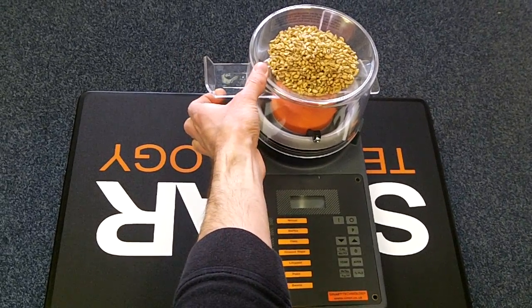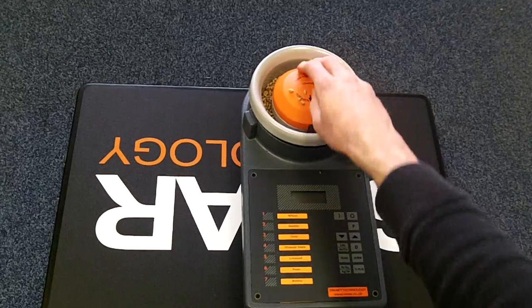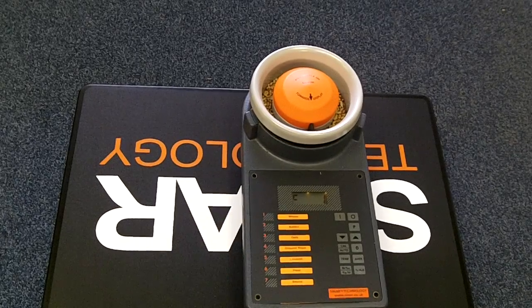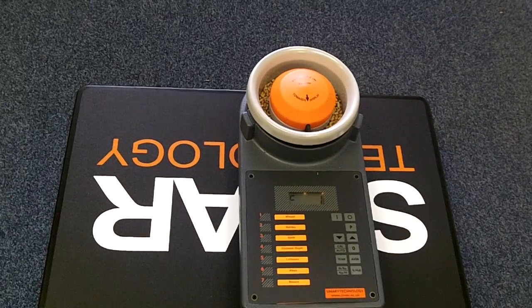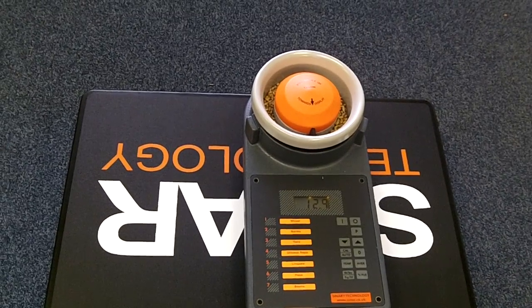Push up on the slide to release the sample and remove the hopper. Switch the instrument on, choose the wheat channel and press the %H2O button at the bottom. The result on the screen should match that shown on the sample bag.